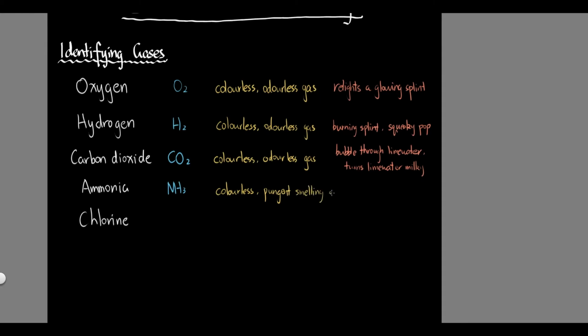A lot of people say ammonia smells like toilet, but you might not be able to put that on an IGCSE test, I suppose. But you can say it's very pungent smelling. Don't say bad. Never say something is bad in chemistry because that's not proper language. Say it's pungent smelling. Anyway, pungent smelling gas.